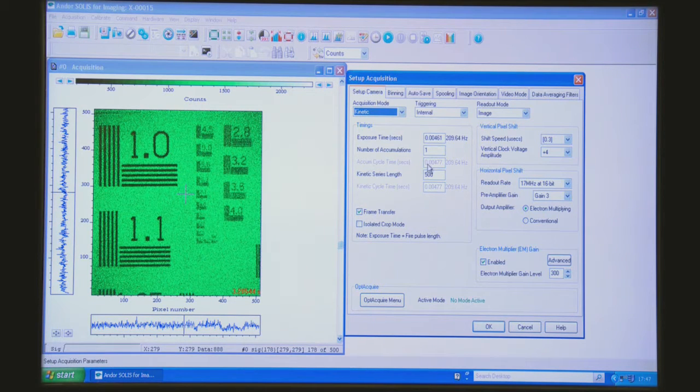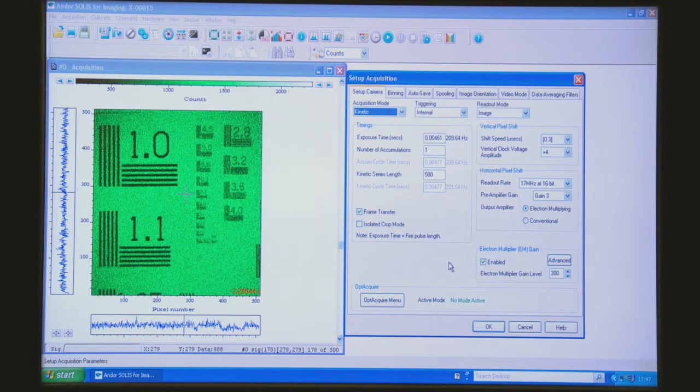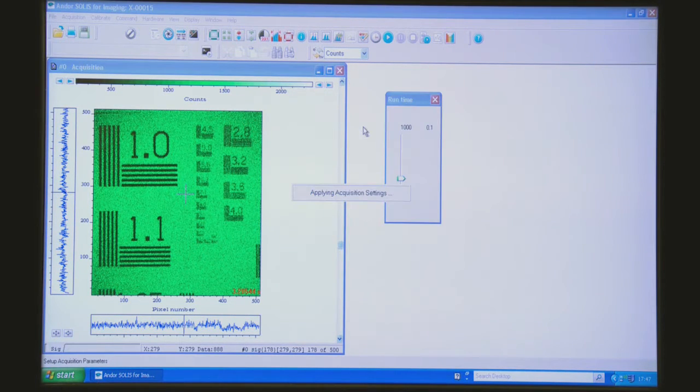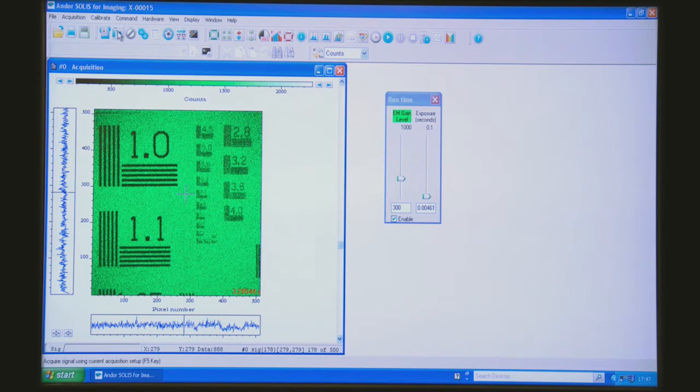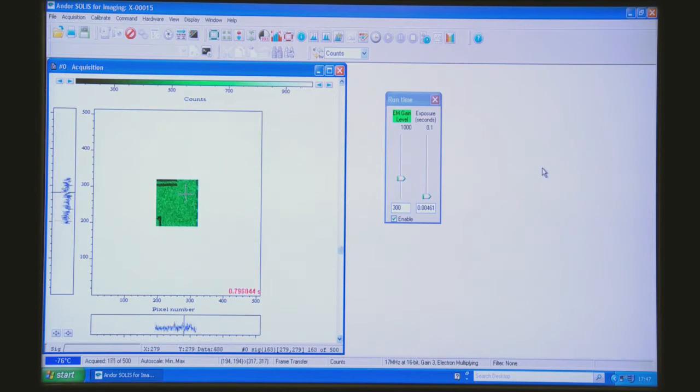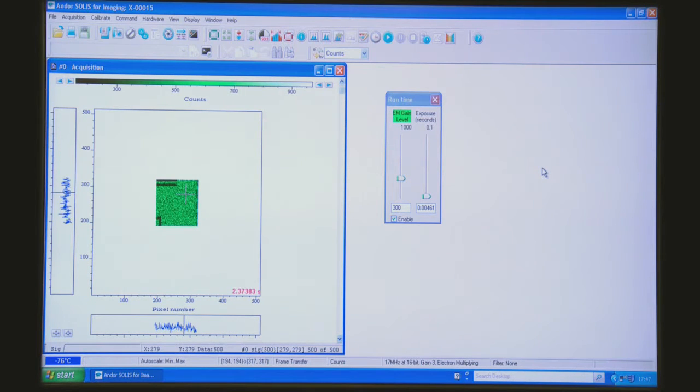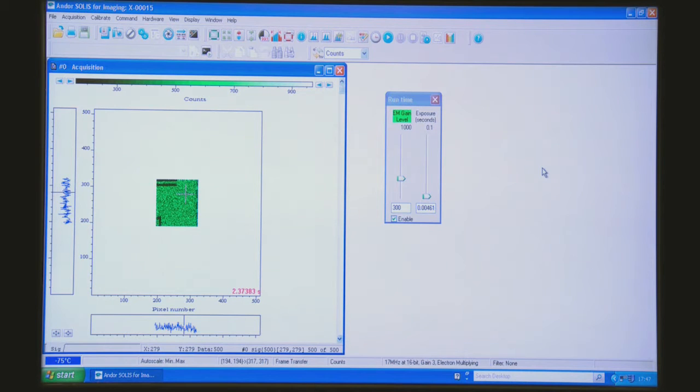If we select that, go with the same 500 kinetic series and hit acquire once again, you can see that's zipped through that 500 frames in no time at all, yet it's limited to a smaller region of interest in the centre.